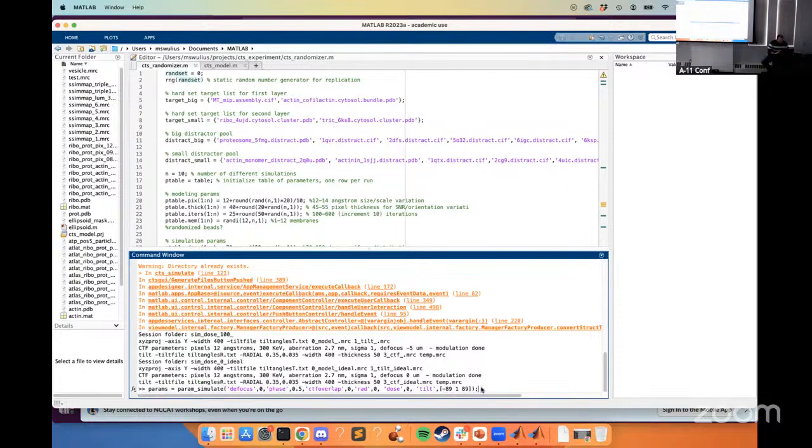All right. So this command line right here will establish all of the parameters, like the defocus. They have defaults. You can just run this command without telling it much of anything, and it'll put all the defaults in for you. But if you want to control them, you have to do it.